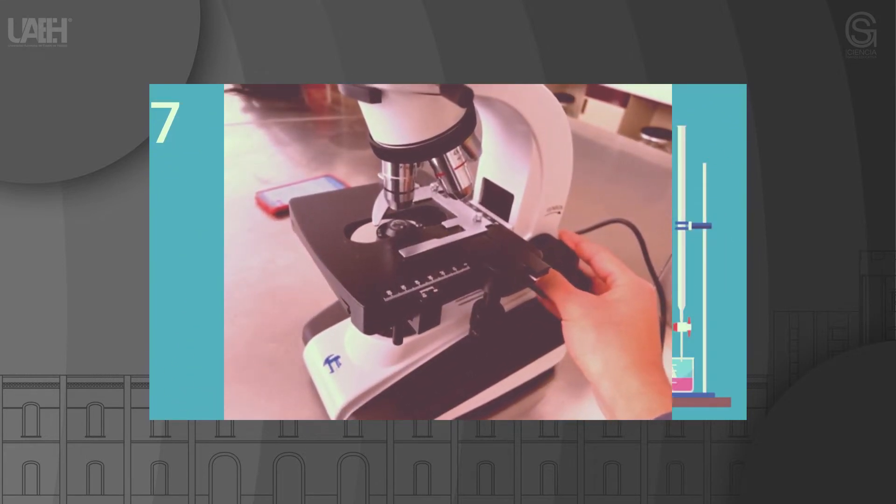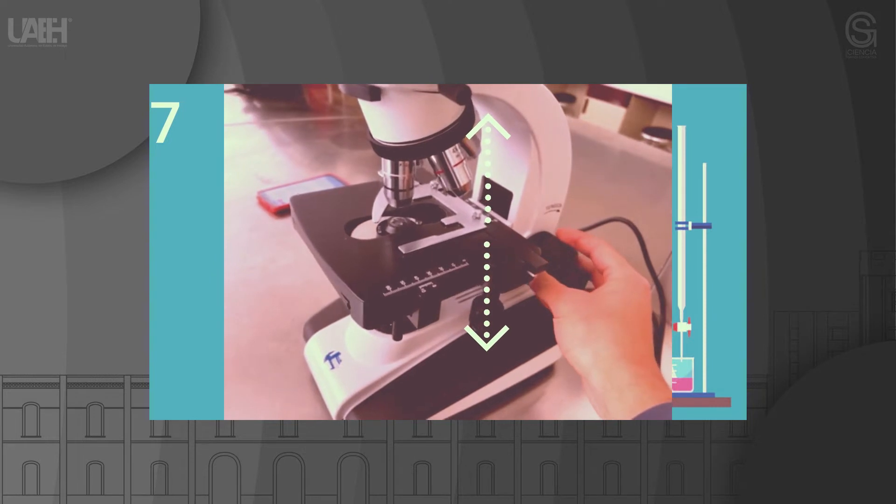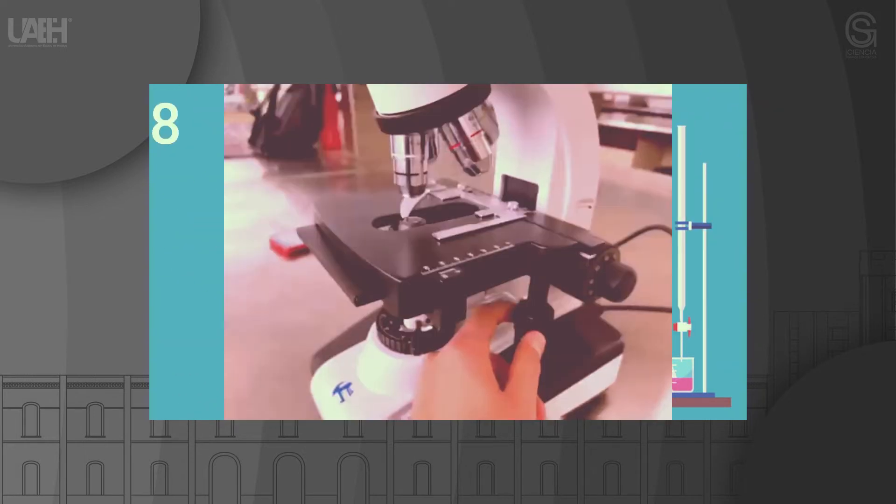Step 7: Adjust the fine adjustment screw to improve the focus of the image and obtain a sharp observation of the sample.